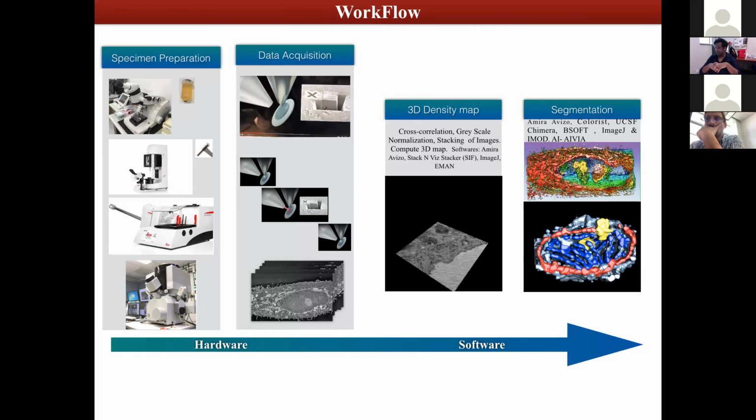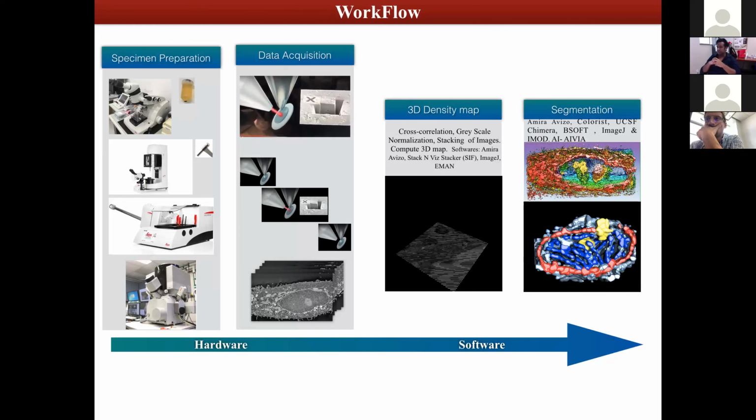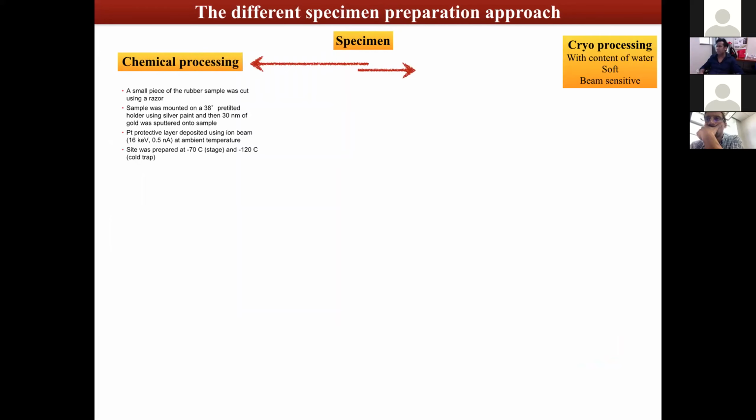Okay, now let's look in a little bit more depth at how we prepare the specimen. We can prepare the specimen in multiple different ways.